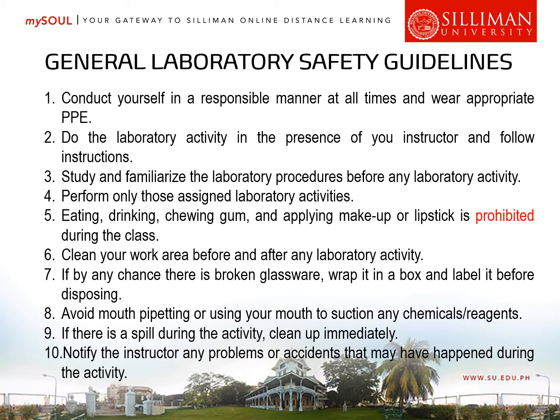Before you start working and after you work or process your specimen, you really need to clean your area. Number seven, if by any chance there is broken glassware, wrap it in a box and label it before disposing. So remember that our broken glasswares, they are considered as sharps hazard, so you have to dispose them properly.